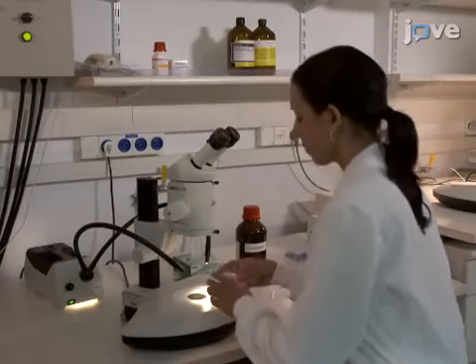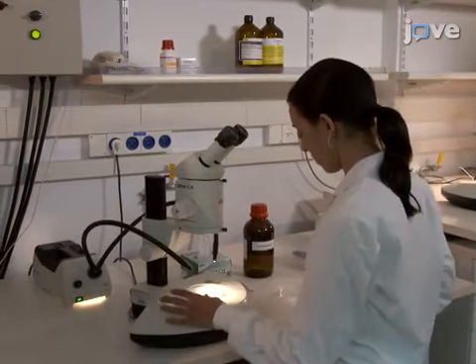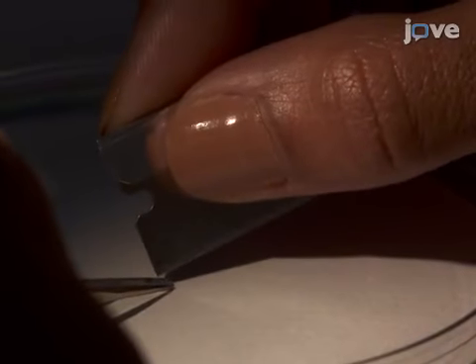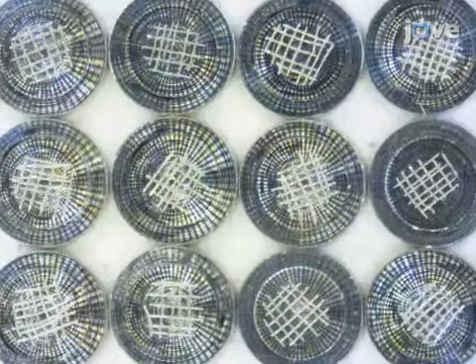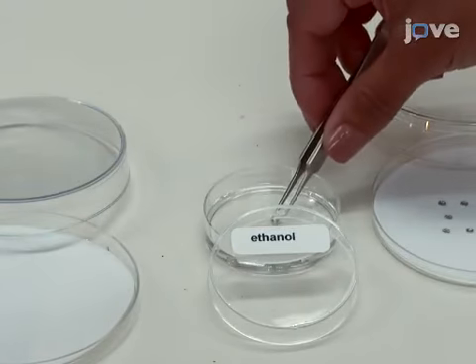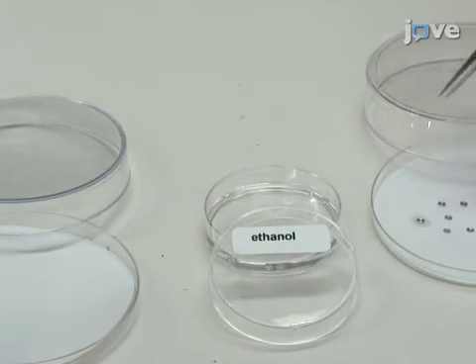To carry out cryofixation of leaf tissues by high-pressure freezing, begin by using the corner of a razor blade to scratch the bottom of the 0.1 mm cavity of a 0.1 to 0.2 mm aluminum platelet. Prepare at least a dozen platelets for 6 samples. Then use absolute ethanol to wash the platelets and keep them in a clean dish.